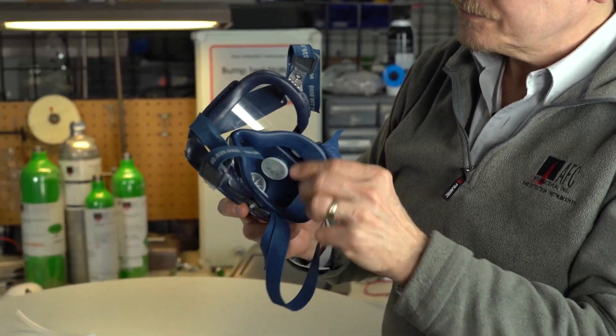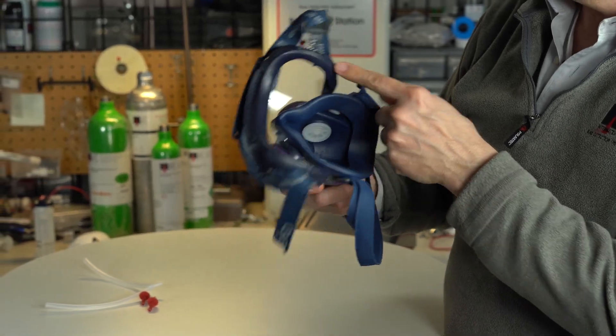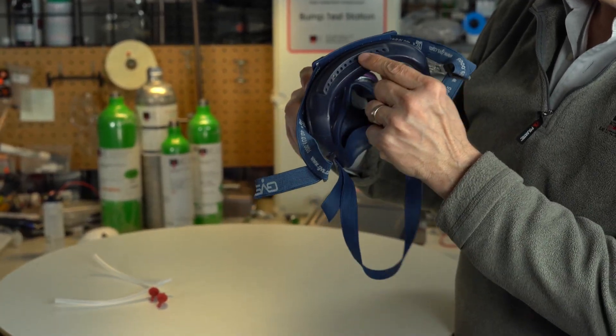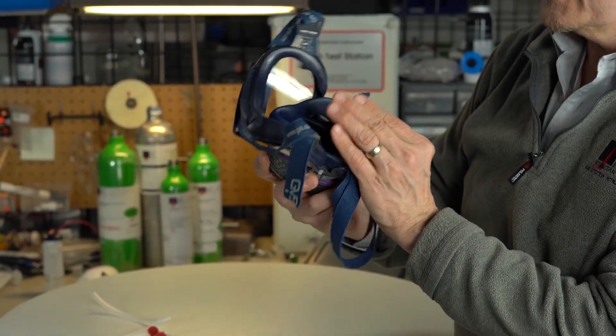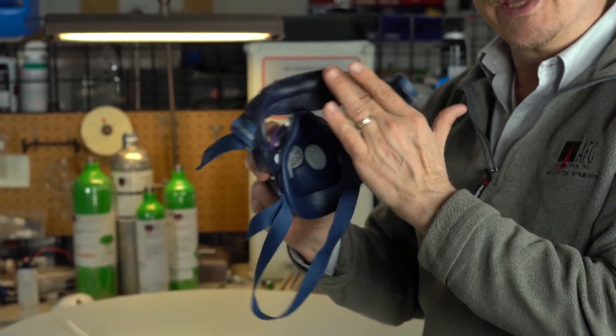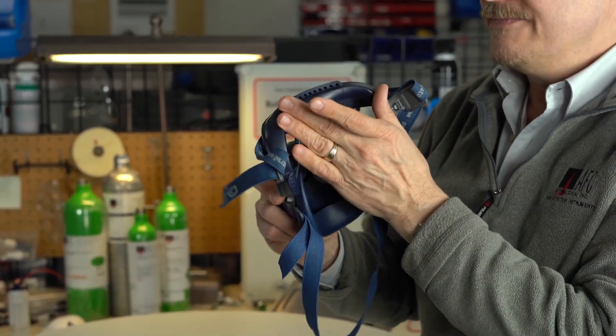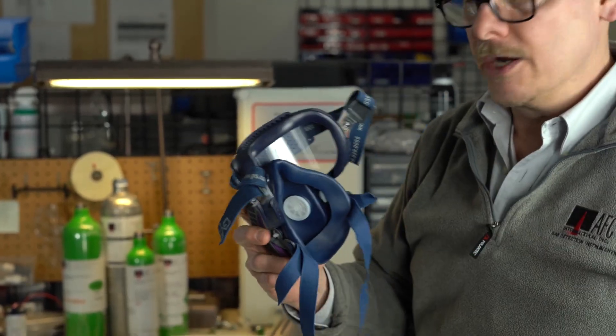The Integra has this nice half face and then your goggles. Your goggles have their own sealing edge and there are little vent holes to avoid fogging. The sealing edge for respiratory protection is created right here. The goggles basically just go up against your forehead so you're comfortable, and they do breathe a little bit so you'll be able to get some air coming through there.